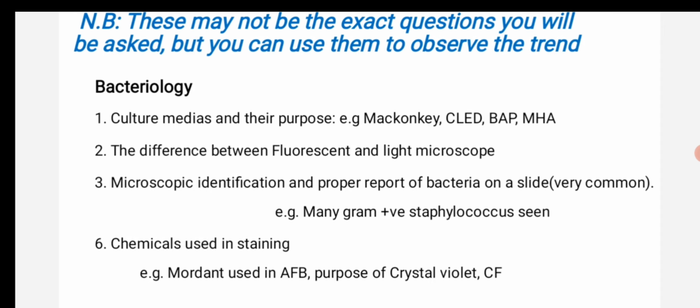We may be given some cultured media and some drug discs, and asked to measure the zone of inhibition, and to identify whether the microorganism that has grown on that media is resistant or susceptible. So the culture, the biochemical test identification and purpose, and the antimicrobial susceptibility test are important.